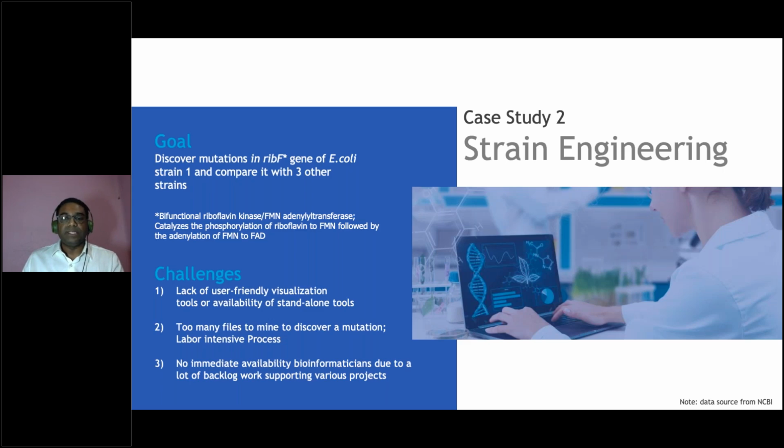As a quick note, for this case study, we are using data from NCBI and not data from any of our clients.